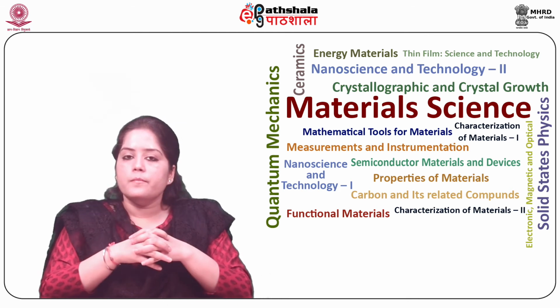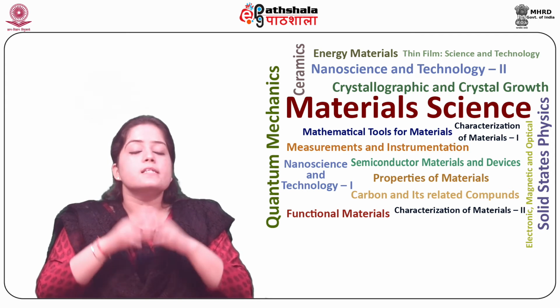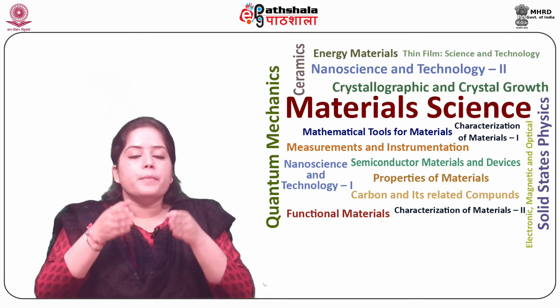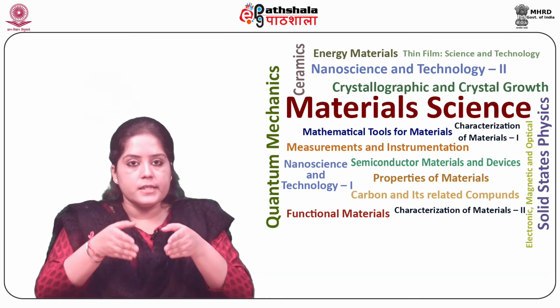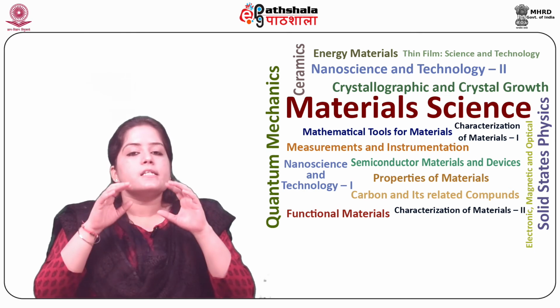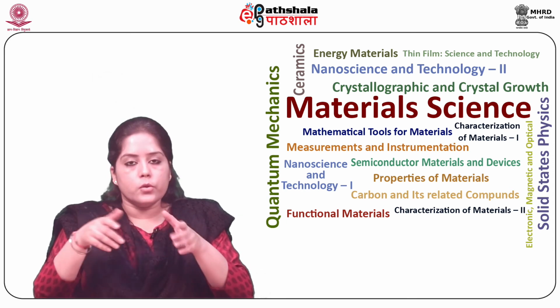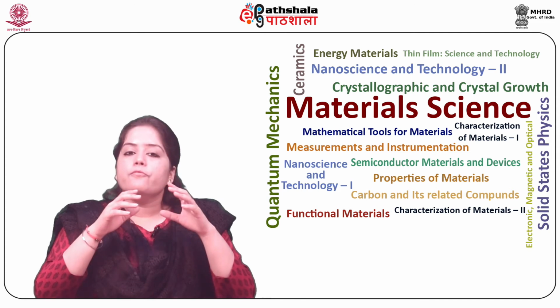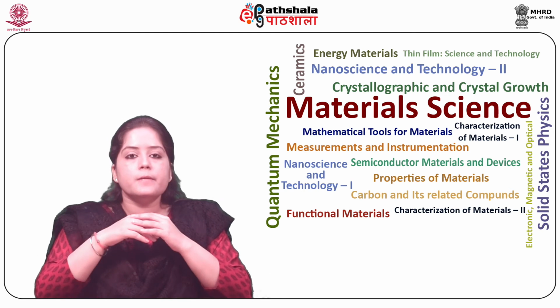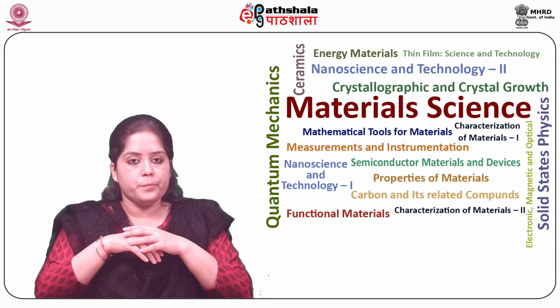And the advantages are: ATR is an IR sampling technique that provides excellent quality data in conjunction with the best possible reproducibility of any IR sampling technique. It has revolutionized IR solid and liquid sampling through faster sampling, improving sample-to-sample reproducibility, and minimizing user-to-user spectral variation.